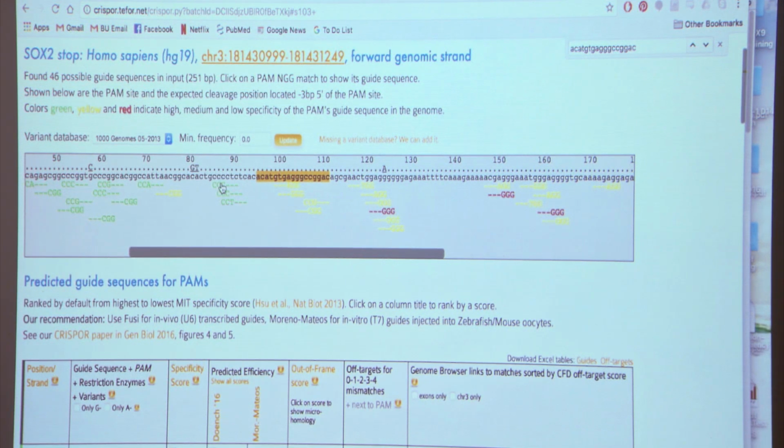So I might, for example, pick a couple of these ones that are a little bit farther from where I want the donor to target but are better in terms of off-target effects, and then maybe pick one of these that's right on top of the stop codon but might have more off-target issues. The hope being that one of these is going to work just fine, and then I won't have to worry as much about off-target effects. But if it is a particularly difficult region to target, having one of these might also be useful. And again, that's a personal preference in terms of the balance between those two things.